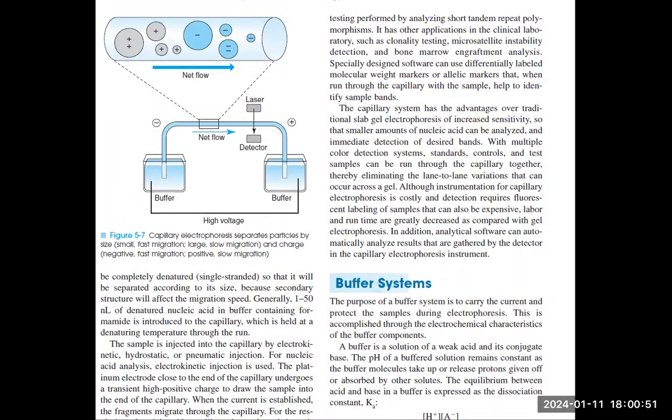But for this one, it's intended for parentage testing, especially for analyzing short tandem repeat polymorphisms, and also for things like clonality testing, microsatellite instability detection, and for the analysis of bone marrow engraftment. So that's for our capillary electrophoresis.